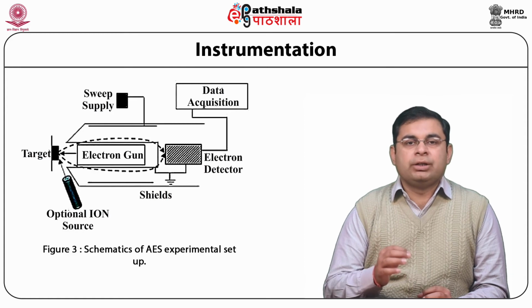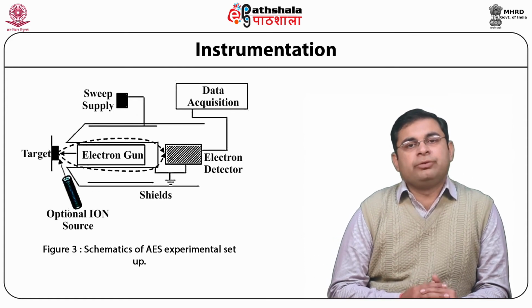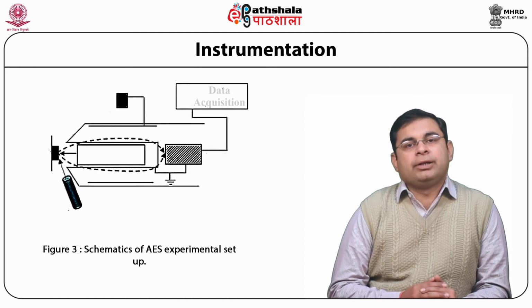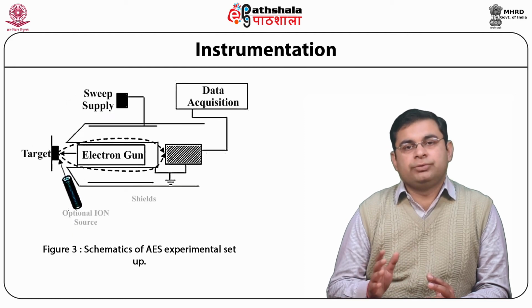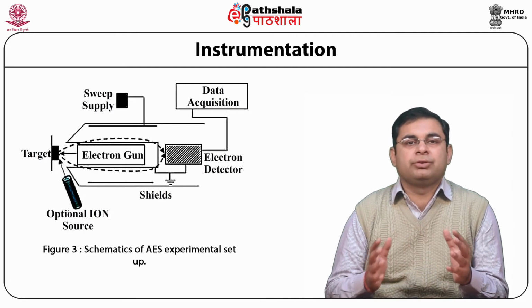Typically, AES runs under the condition of ultra high vacuum. This prevents electron scattering from residual gas atoms and the development of a thin gas adsorbate layer on the sample surface, which results in degradation of analytical performance.